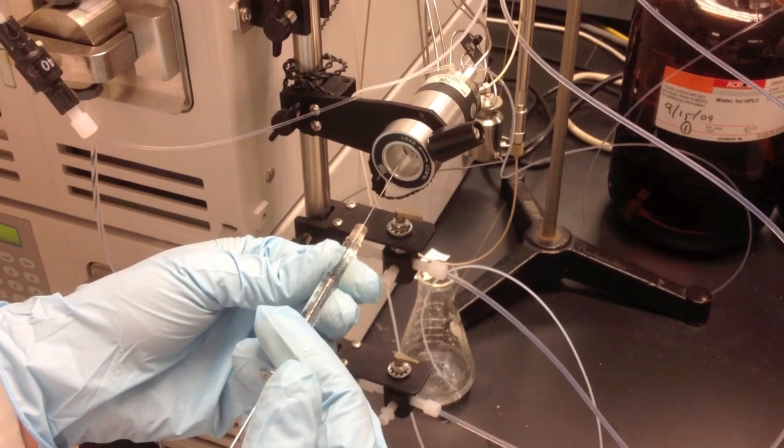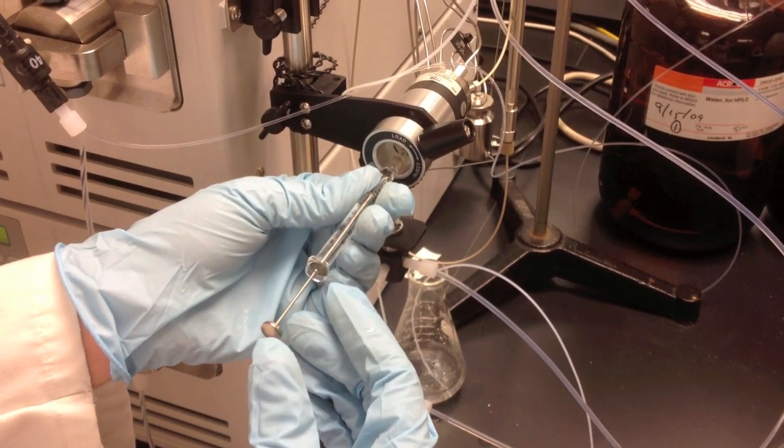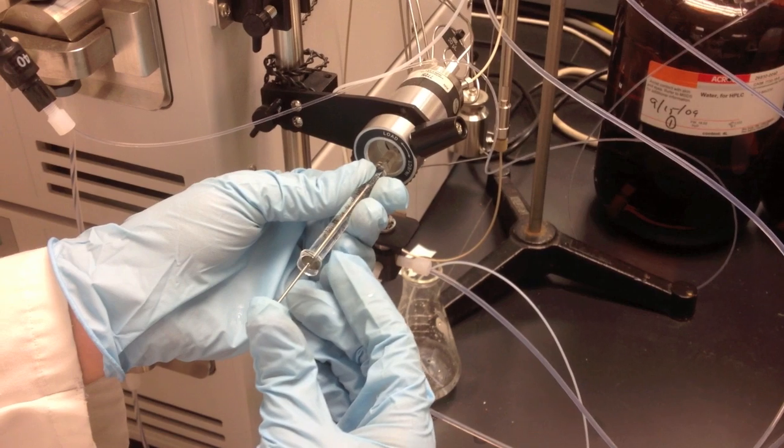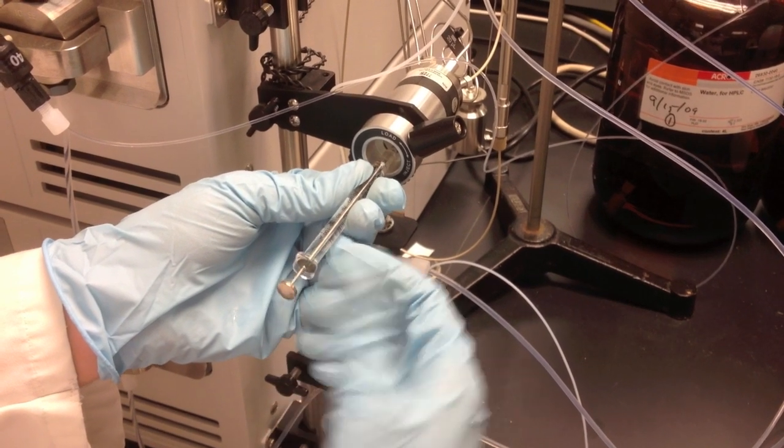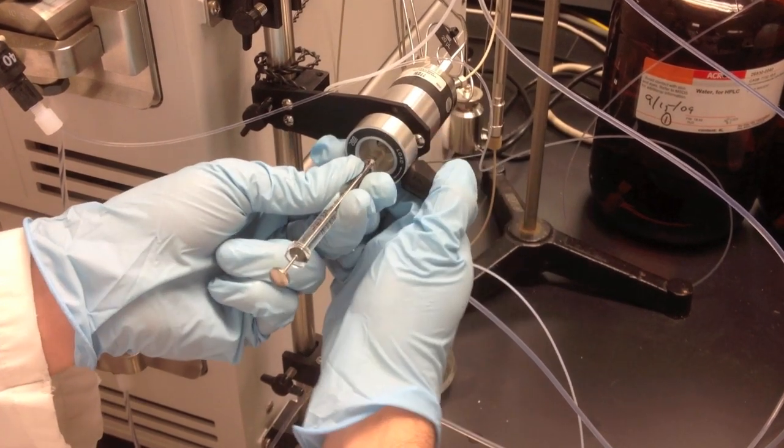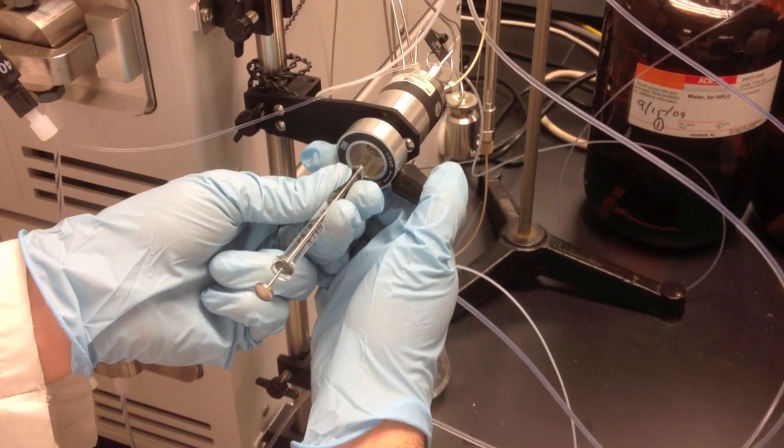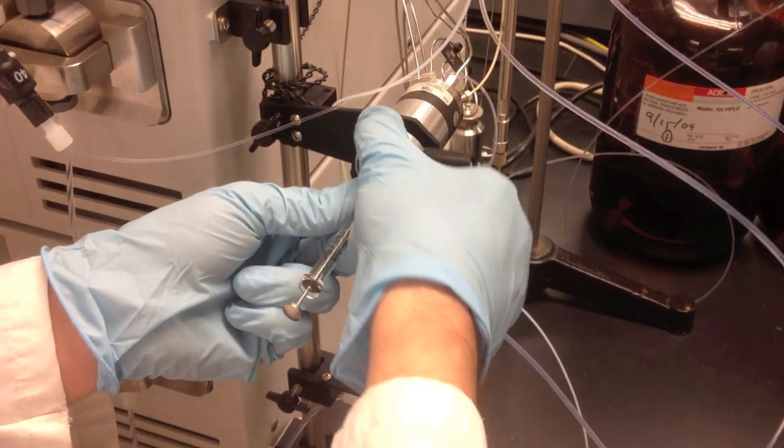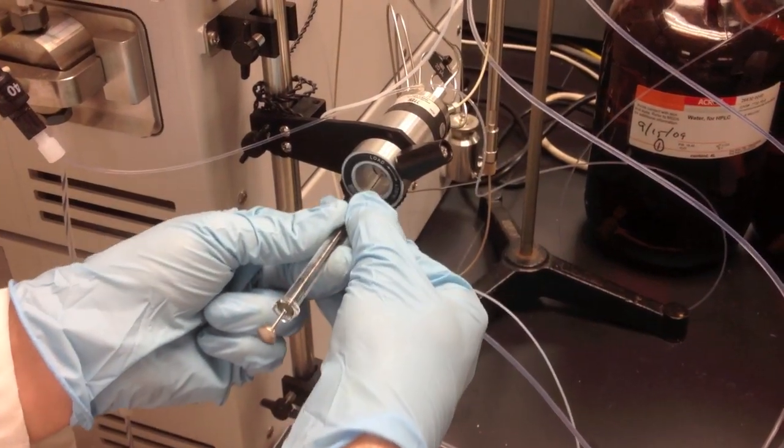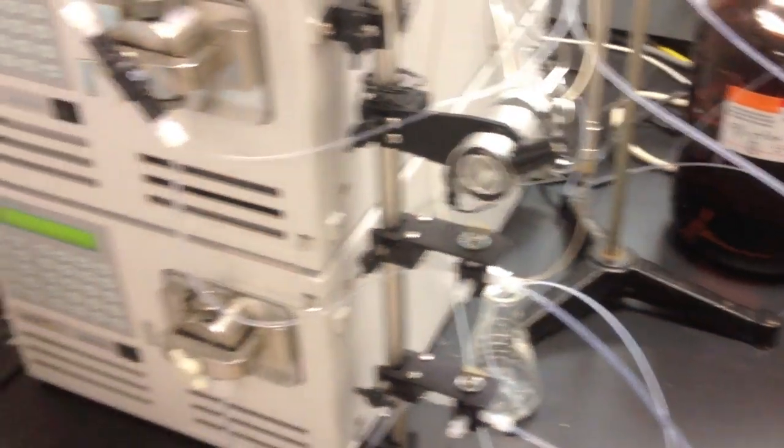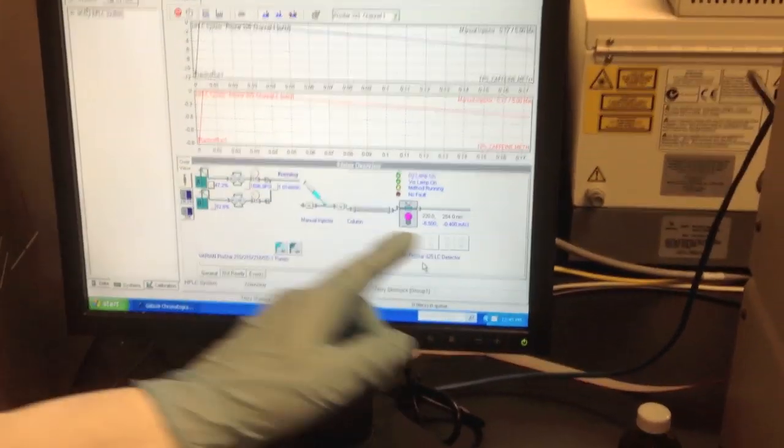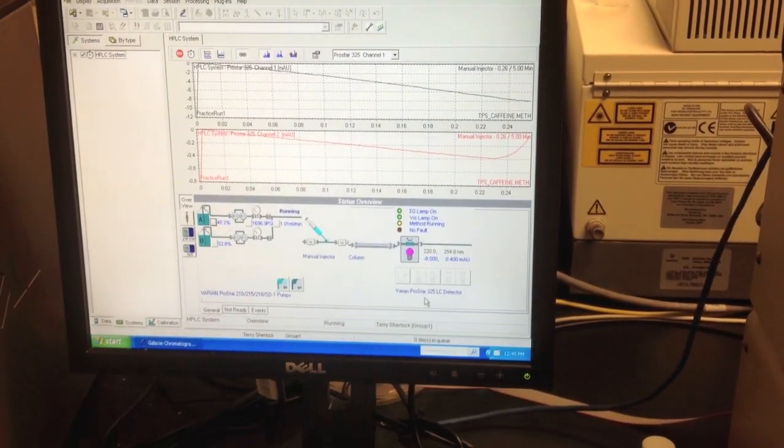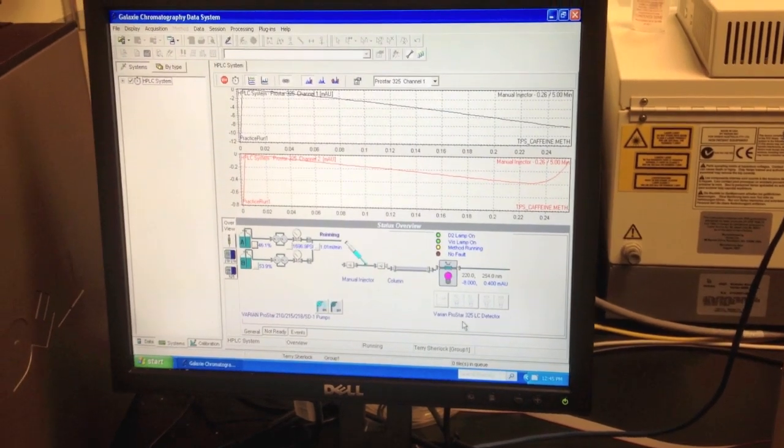So to run through it, push it in until it breaks. Put our sample in. Now down. One, two, three, four, five. Up. Remove. And if you'll come right over here real quick, you'll see that the machine is now reading and it's running. So at this point, we get to sit and wait.